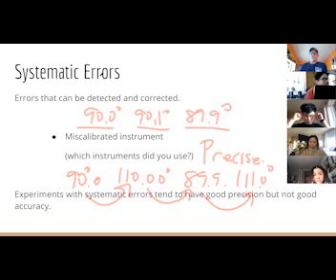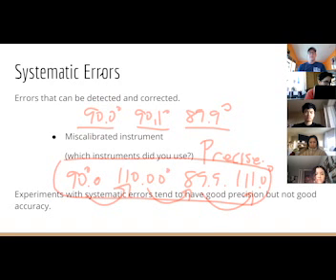If I ask 100,000 people, that's probably going to be fairly precise and accurate. Something like this, where you have the average, is something we're going to do today: measure something over and over and over again and see how precise versus how accurate it is. So this would be accurate, but not very precise. But of course, being great scientists, we would like to be both, if at all possible.